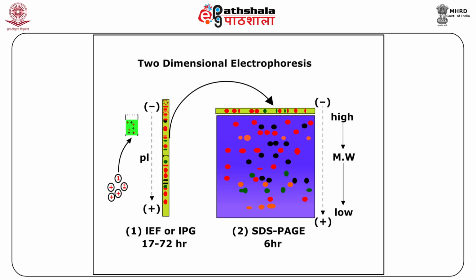This analysis would provide clues to what factors are involved in creating that condition. Two-dimensional gel electrophoresis is a sensitive and powerful technique to analyze the proteome.